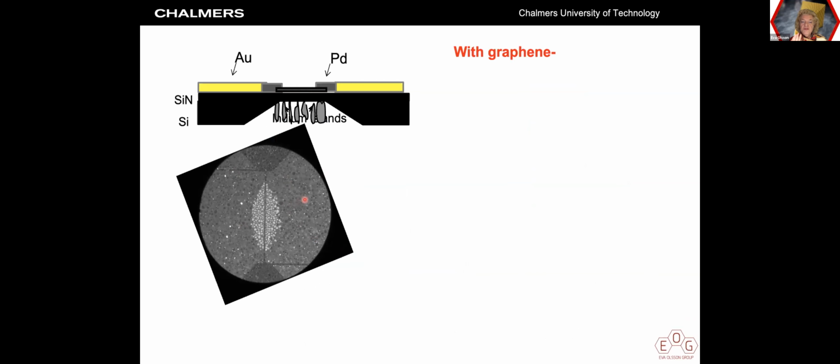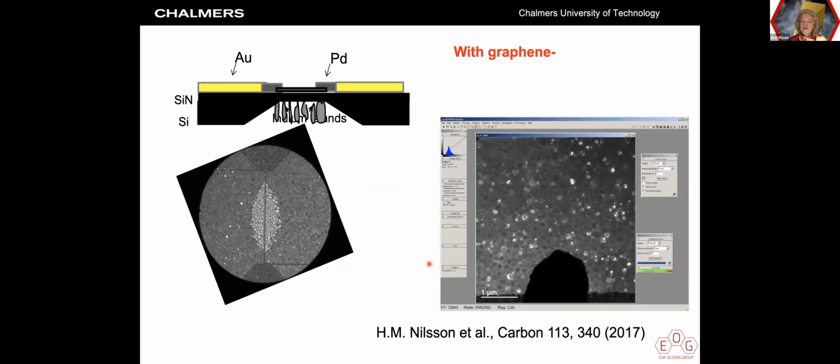What happens if we put graphene on this substrate? In this case, we now have our contact and we are drawing current between this manipulator over to the electrode that is positioned down here. So we are drawing current from here down here. What we're looking at now is that the voltage is step by step increasing between this electrode and this other fixed electrode.